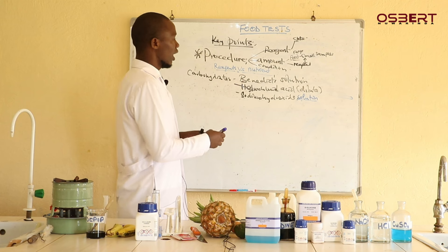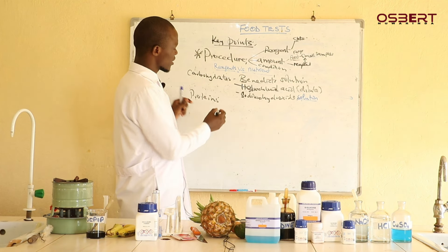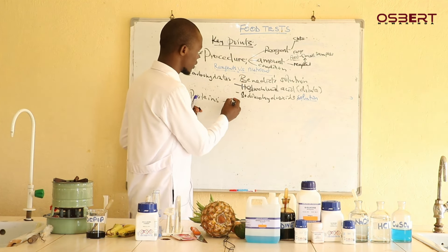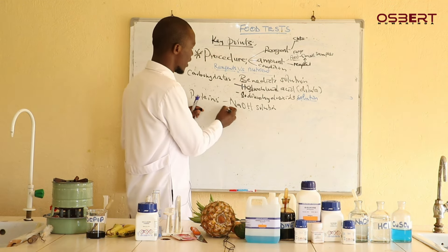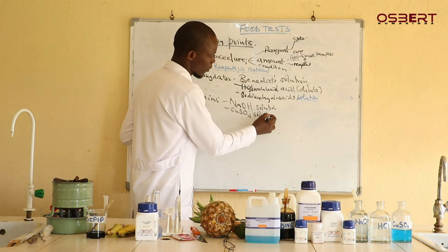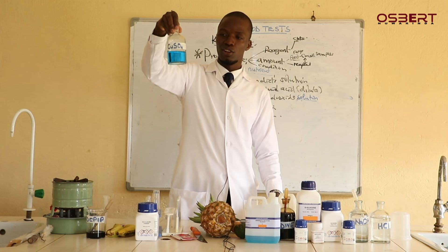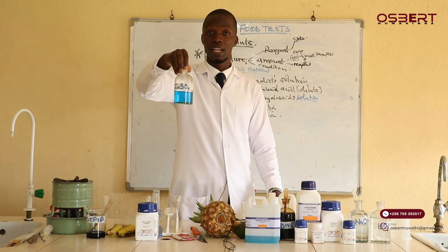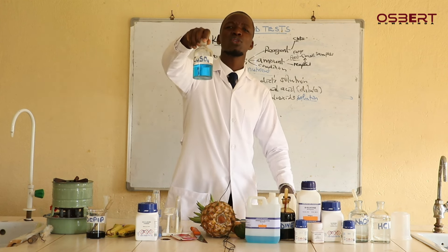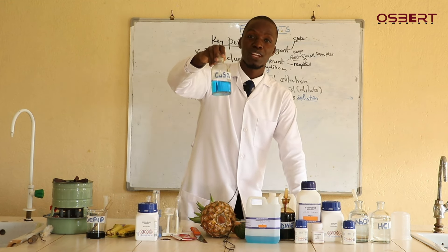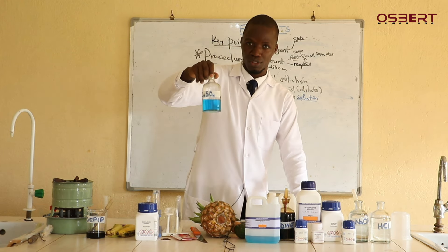Key point two: here I talked about carbohydrates, but for proteins we use different reagents. For proteins, we use sodium hydroxide solution — which I've already shown you — and copper II sulfate solution, which is in front of us here. Note that copper II sulfate solution looks similar in color to Benedict's, so you need to be careful not to mix them up. We use the solution form, not copper II sulfate crystals.